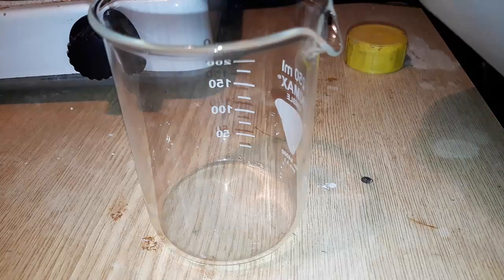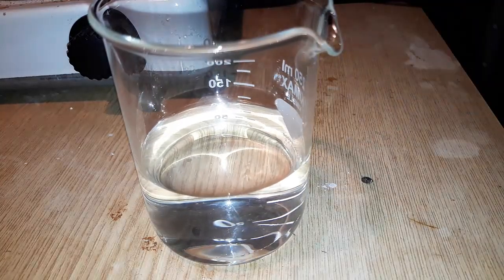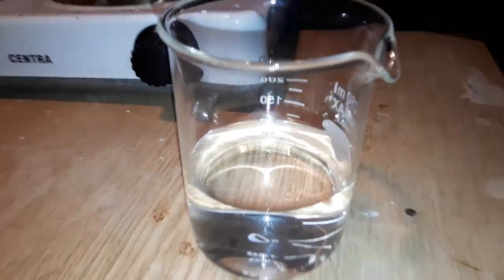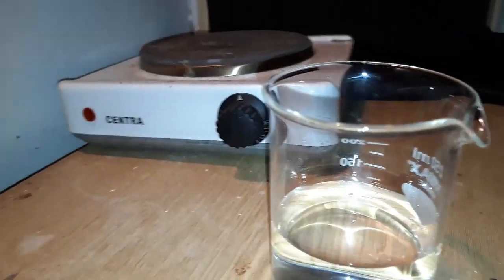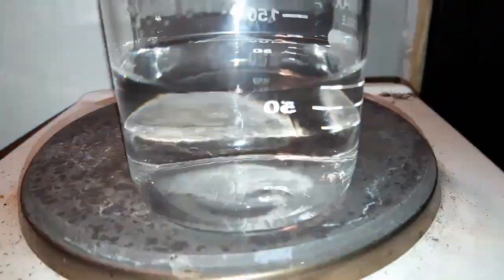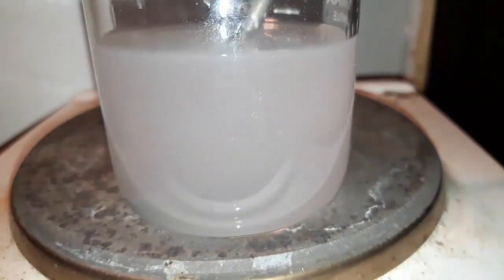Now it's time for the recrystallization. Since I couldn't find a reference for how soluble salicylamide actually is in methanol, I just eyeballed it and measured out 125 milliliters. This was way too much and probably the cause of my low yield — I would probably need to use about 30 milliliters to start and add more if needed.